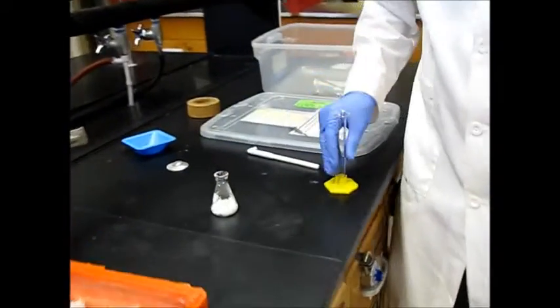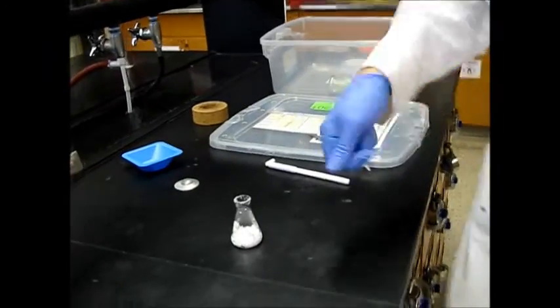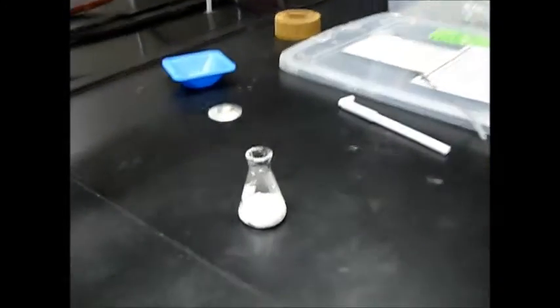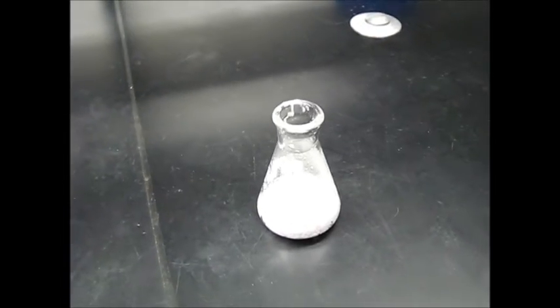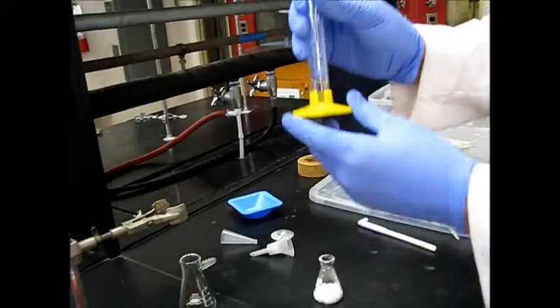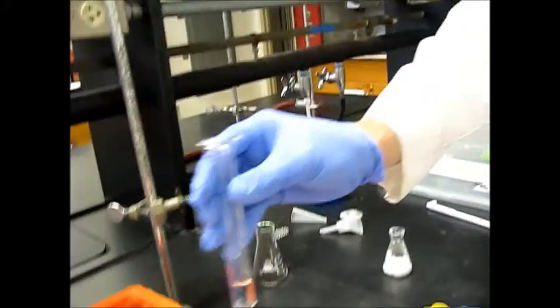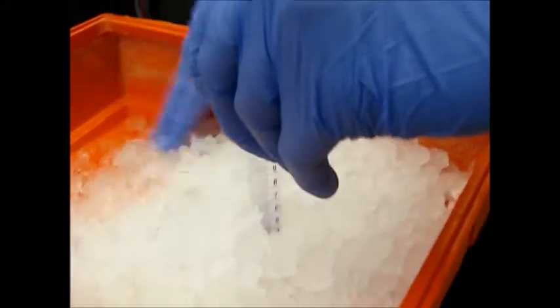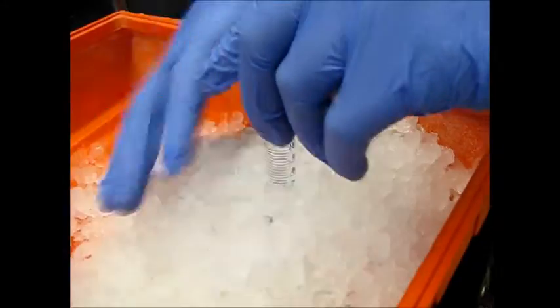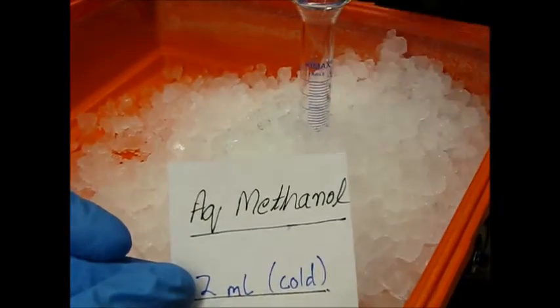Before we do that, I'm going to grab 2 milliliters of methanol, go ahead and set it in the ice so that it's nice and cold for whenever we need it. So we got 2 milliliters of methanol. So what we can do with this is actually just take off this base part and set this directly into the ice. I want to make sure that it's nice and supported, but it doesn't tip over. Awesome. So we'll let that chill out for a while.